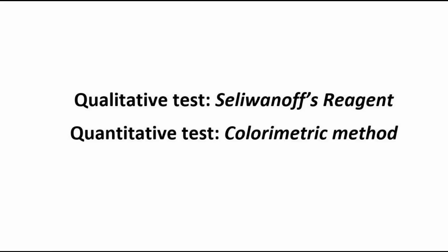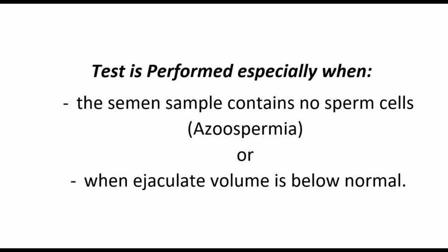Fructose test is an optional parameter in routine semen analysis and is performed especially when the semen sample contains no sperm cells, a condition known as azoospermia, or when ejaculate volume is below normal.